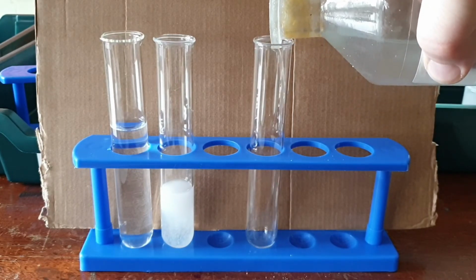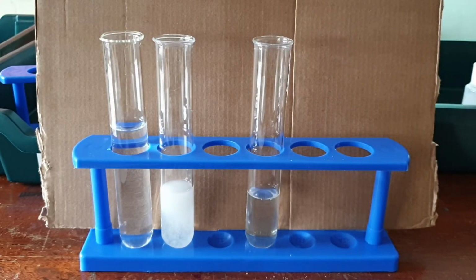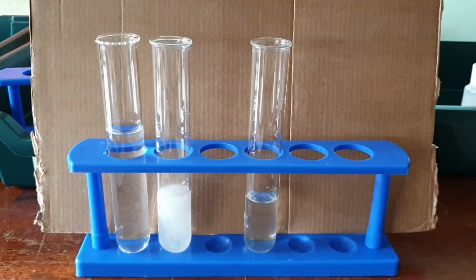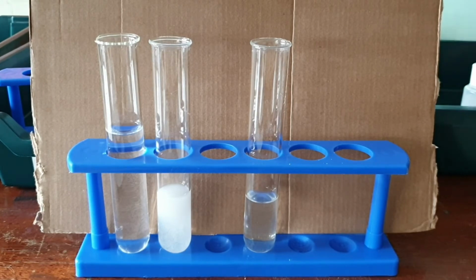Stay tuned to find out. Imagine that instead of knowing that that's sodium carbonate, it is a mystery substance. We add any acid, which will produce carbon dioxide gas, and then the test for carbon dioxide is to bubble it through lime water.